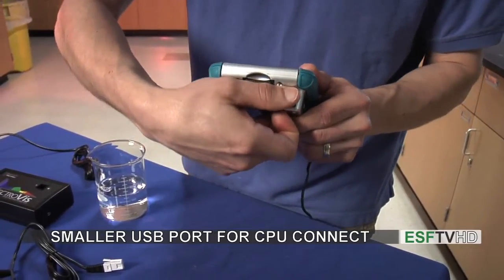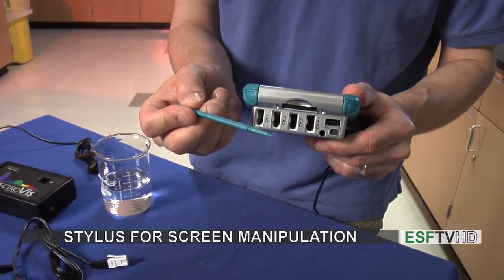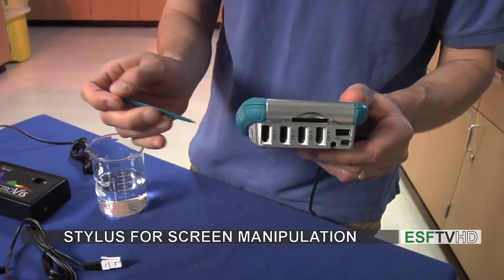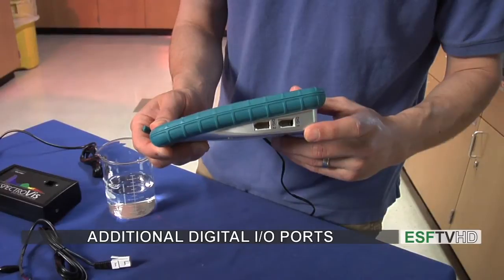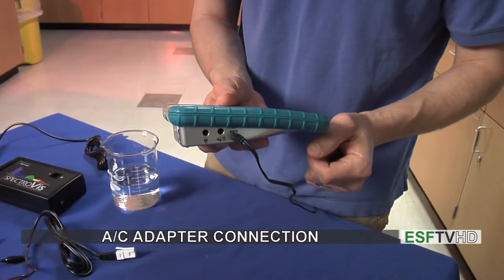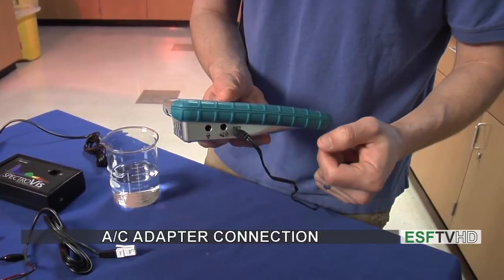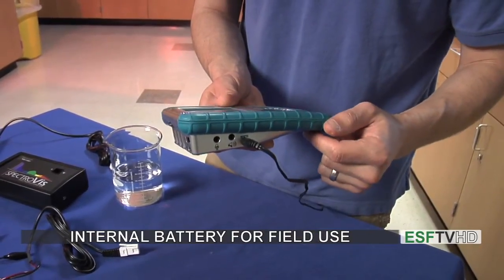Very importantly, hidden in here is a little stylus. If we pull this out we can use the stylus to tap on the screen. On this side of the unit we have digital inputs which we're not going to end up using in the lab at all. And on this side we have the port for the AC adapter. The unit does have batteries in it so we can use it on battery in the field, or we can use it plugged into power when we're in the lab.